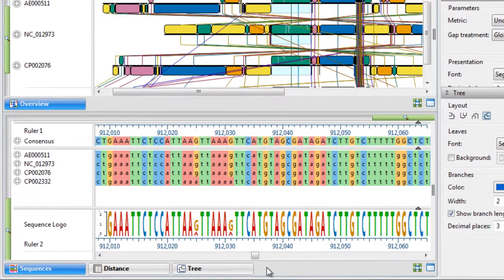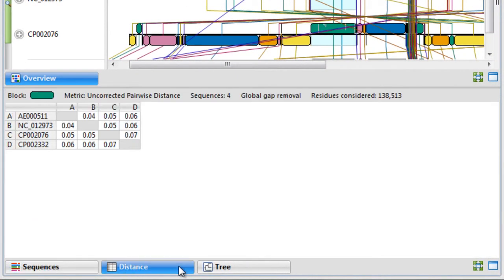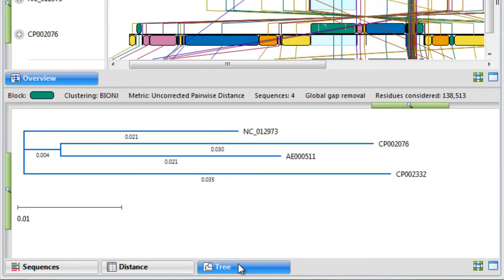Using the tabs at the bottom of the window, you can analyze the distance matrix or the tree view for the active blocks.